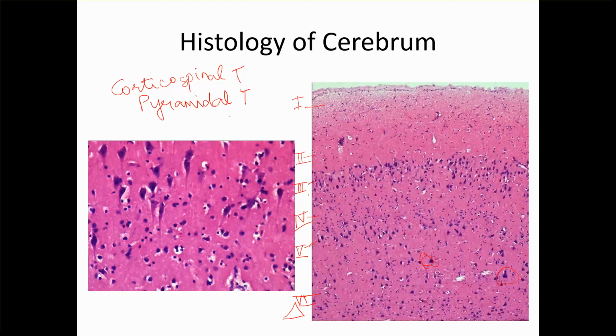Here there's a higher magnification, in which you can see the pyramidal cells. So if these cells or the layers are asked, I hope you will be able to identify them.